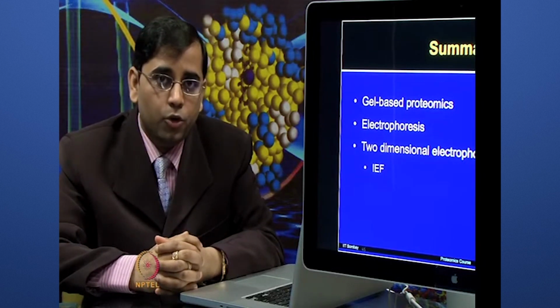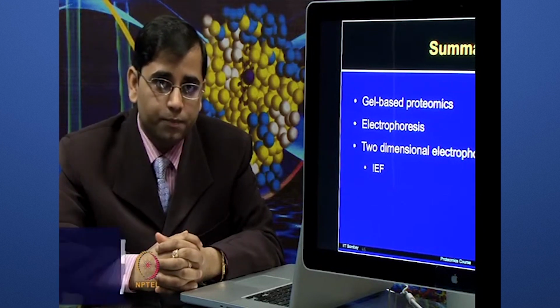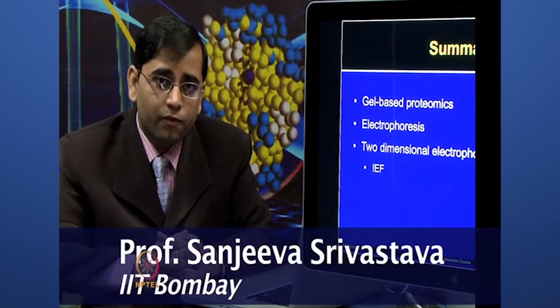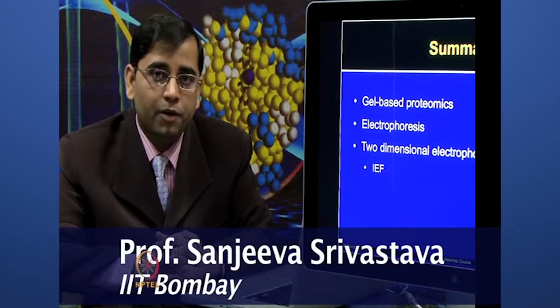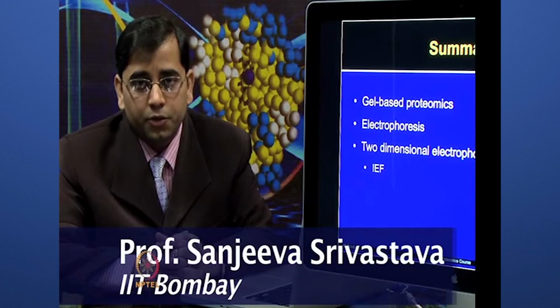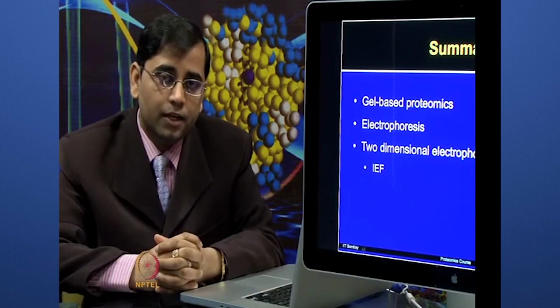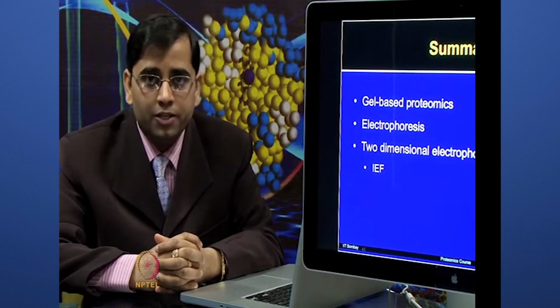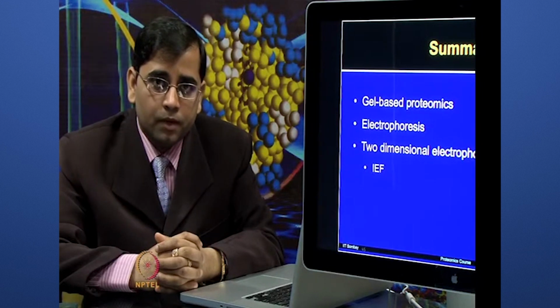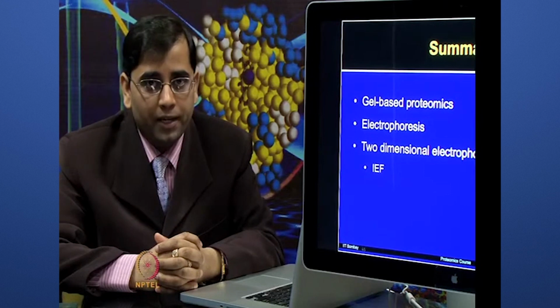I hope by now you are clear about the different types of techniques being used in gel-based proteomics and the different workflow steps involved in performing this process. We will continue our next lecture on the 2D workflow, and we will study the next steps, including the equilibration of strips, SDS PAGE, staining gels, obtaining images, analysis of those images, spot picking, etc.